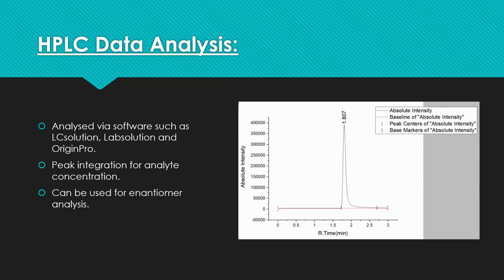These detectors are also used to identify the compounds present within the sample via the use of an absorption spectrum and mass to charge ratios. This analysis becomes difficult when there is noise present, i.e. matrix interference, making sample preparation and quality assurance methods extremely important.